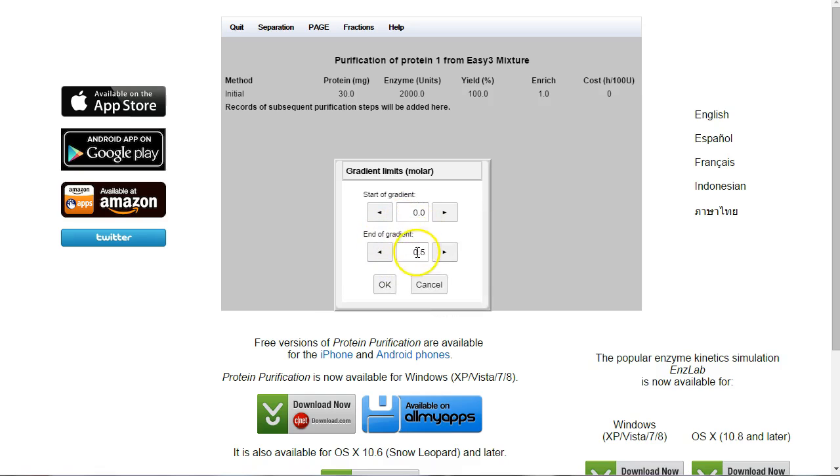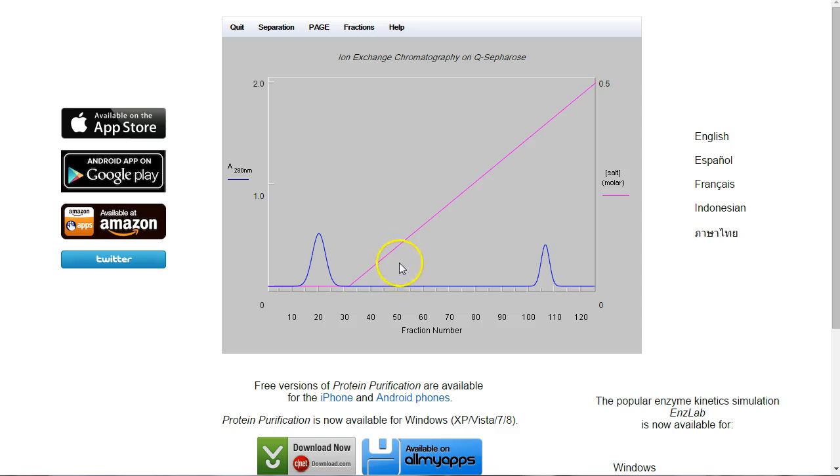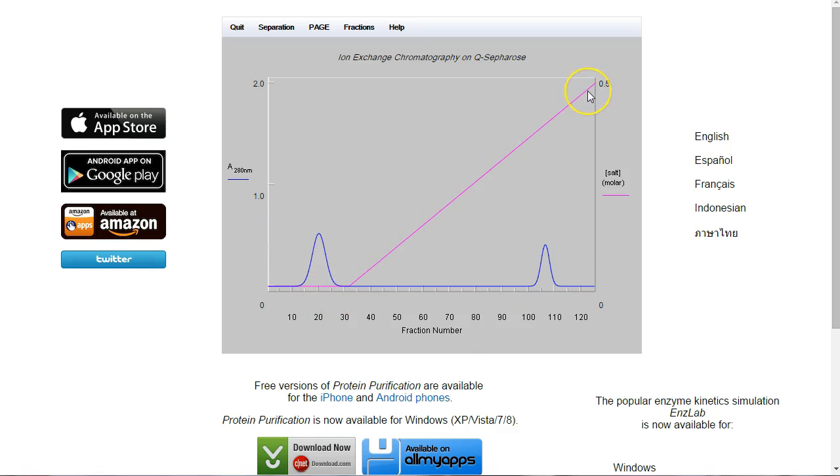The salt gradient is also fine. So we'll click OK on that. And here we go. So now we have two peaks, one peak here and one peak here. The purple line is the salt gradient.